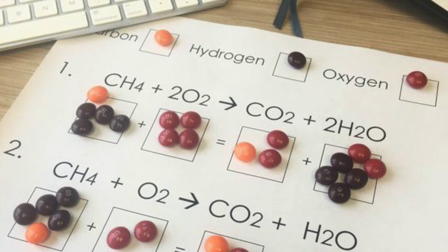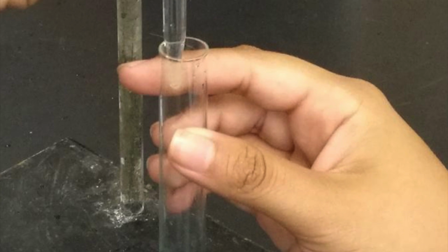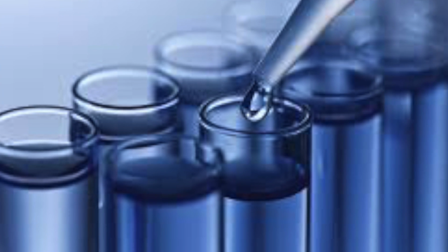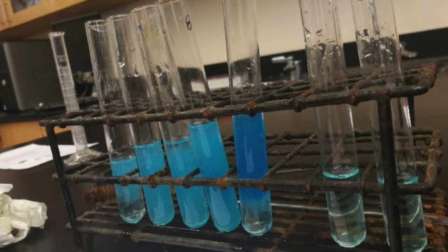First, we fill the burette with the right amount of potassium hydroxide and copper sulfate. Second, you label all the test tubes. Third, you write a balanced equation with the reactants that you have. Fourth, you put 5 milliliters of copper sulfate in all 8 test tubes. Fifth, you add potassium hydroxide to the 8 test tubes according to what amount the chart is telling you. Then, you add water to the 8 test tubes in order to have filled up each of the test tubes up to 13 milliliters. Finally, we waited 15 minutes and measured the precipitate.